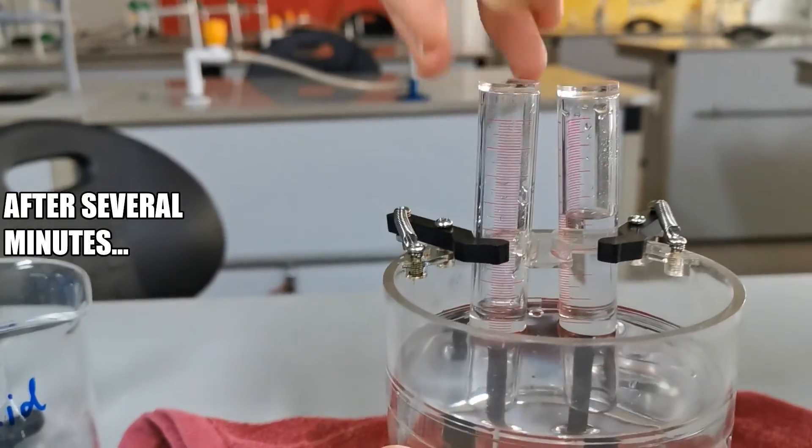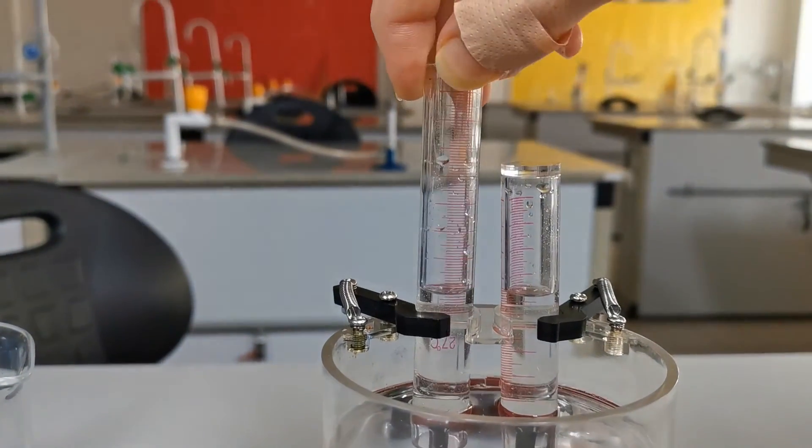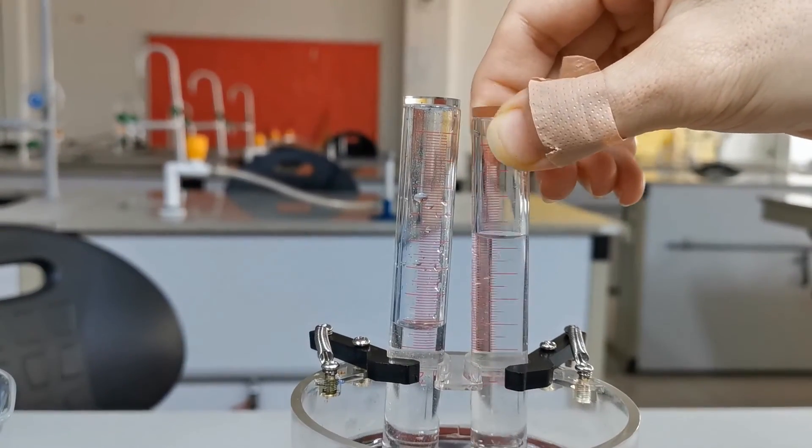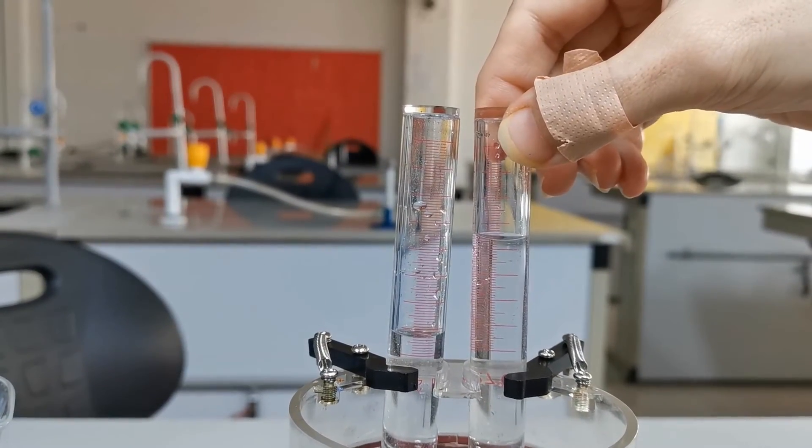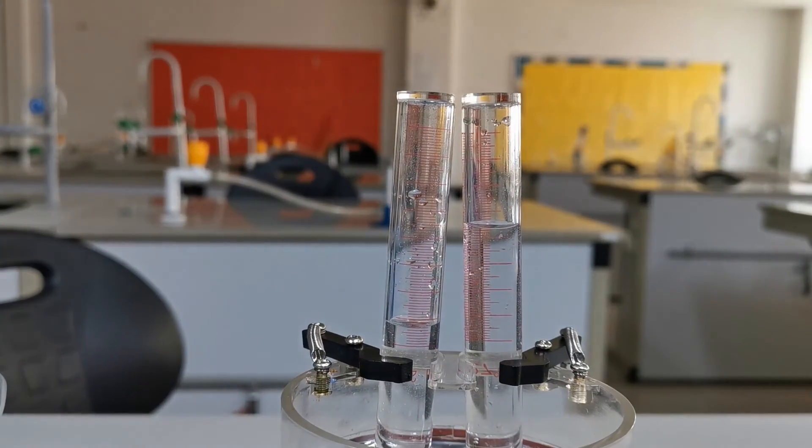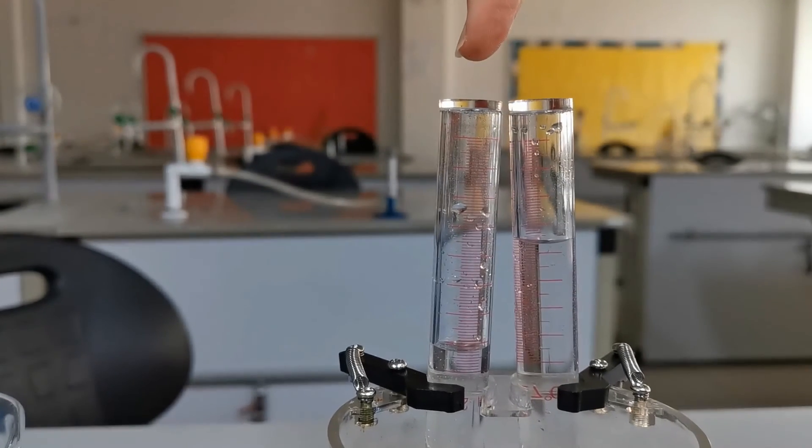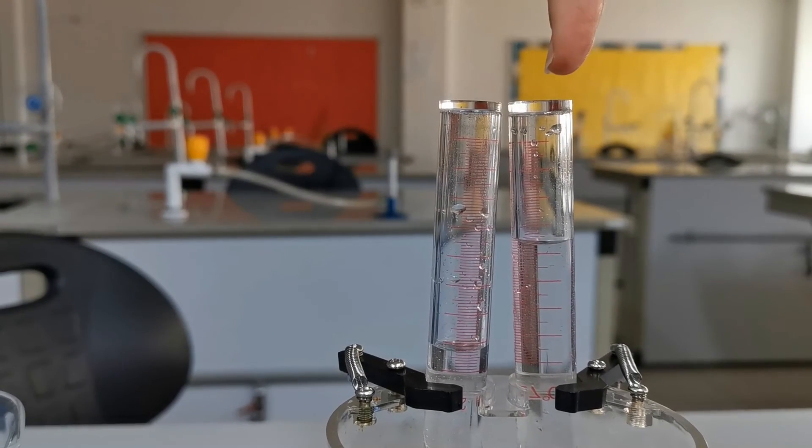As you can see, the volume of gas produced on the cathode is around twice the volume of gas produced on the anode. So this is hydrogen and this is oxygen.